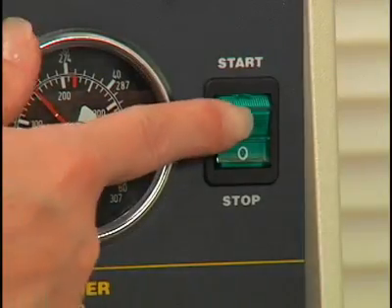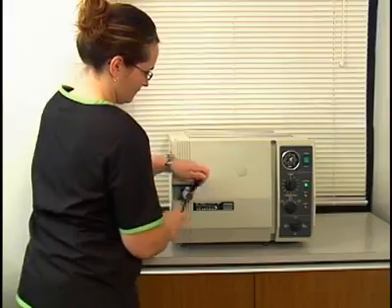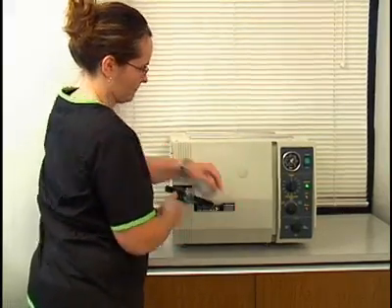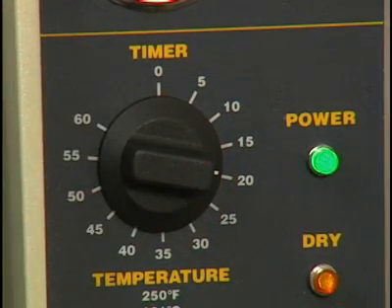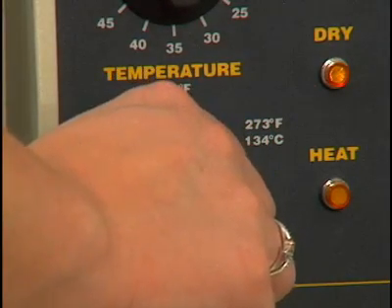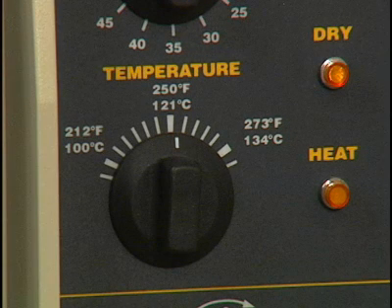Turn on the autoclave. Fill the inner chamber with water using the appropriate control. Securely close and latch the door of the autoclave. Set the timing control for the proper time needed to sterilize this load. For this load, it will be 20 minutes. Next, set the temperature control to the desired temperature, which is usually 250 degrees Fahrenheit or 121 degrees Celsius.